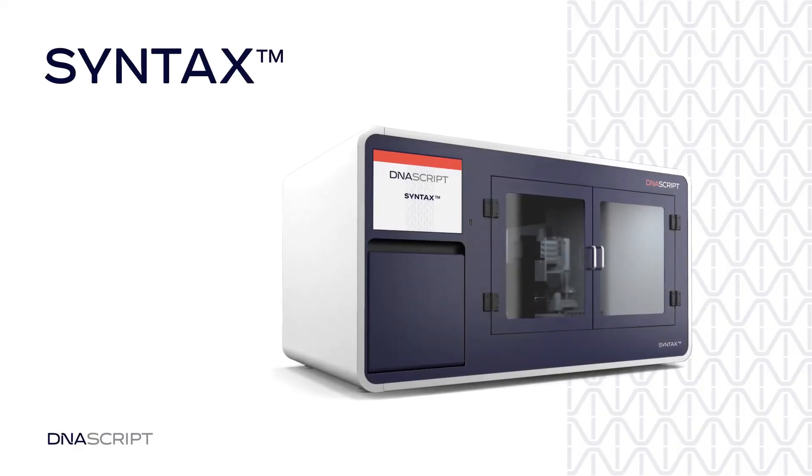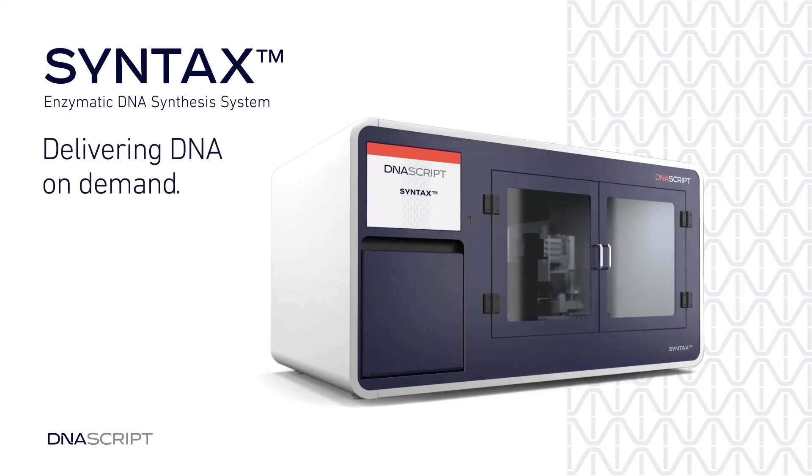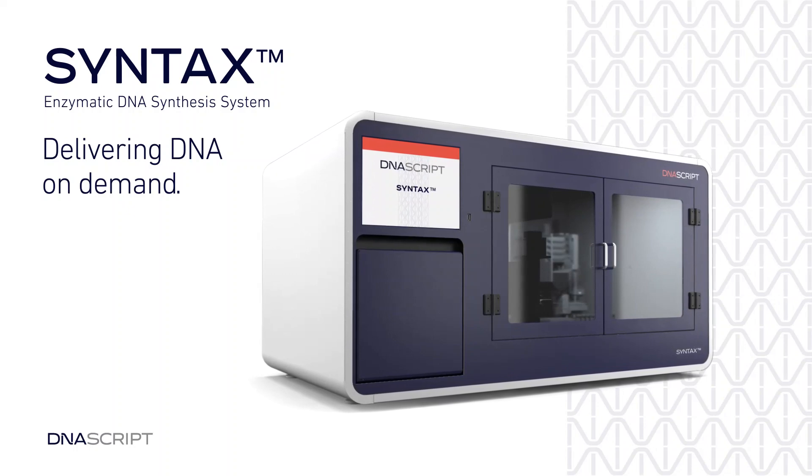Syntax, a revolutionary enzymatic DNA printer, simplifies complicated chemical synthesis for efficient benchtop oligo production.